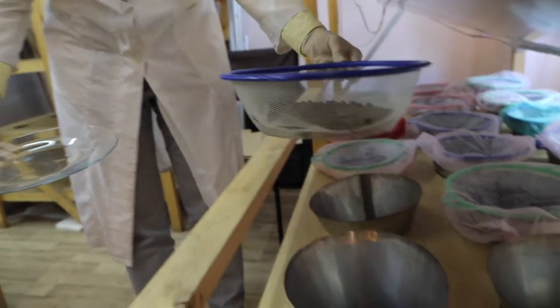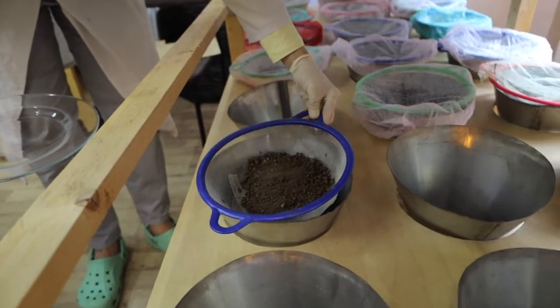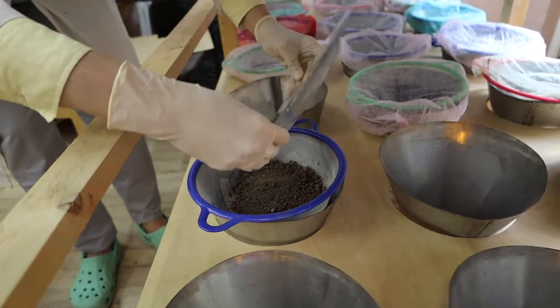Now, we gently place the sieve with soil and litter on top of the funnel. Don't forget to check the labels and ethanol.